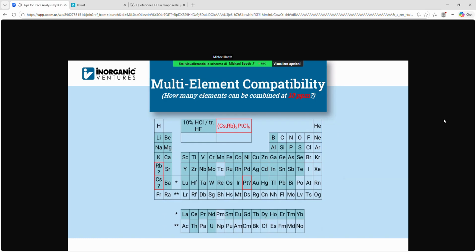at 10 ppm and 10% HCl. You can roll your precious metals into the others. The only issue that you will have, and we've seen on occasion, is issues with platinum and either cesium or rubidium. So cesium or rubidium can form this platinum hexachloride compound. That is going to form this precipitate. It shows up on occasion, so we would split out the cesium or rubidium for that. But again, those are elements that are not really requested very often with all the others.